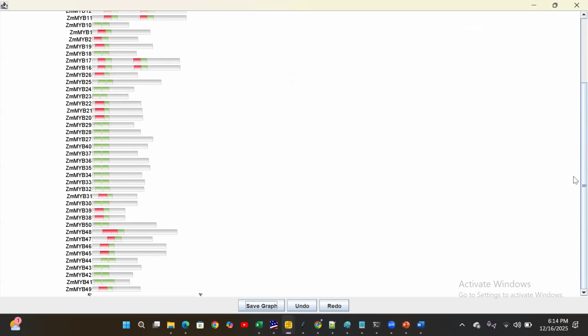Okay, sure. And all of you, please also do this analysis, define your topic, download all the sequences, and also do some CDD and domain analysis, please. All of you.